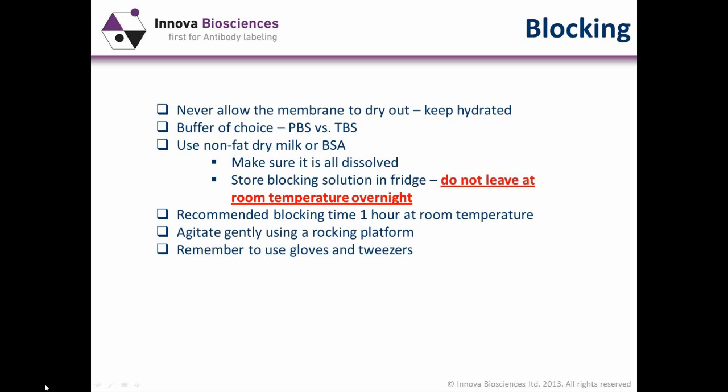So as I said, don't be tight with your blocking solution. Make sure there's plenty to cover the membrane and plenty to allow for effective blocking. It's important to agitate gently using a rocking platform. It's pointless just having it sitting on the desk. And please remember to use gloves and tweezers.